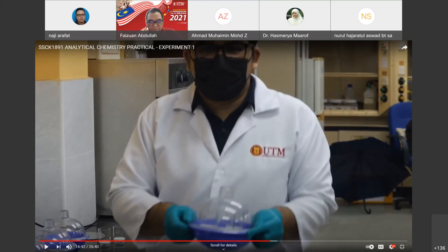Okay, guys. Why do I need to put the crucible, after heating it in the oven, inside the desiccator? Right? The desiccator contains the silica gel at the bottom. So what is the purpose? Remember, we are doing gravimetric analysis now. So relate it. Why do I need to use the desiccator?